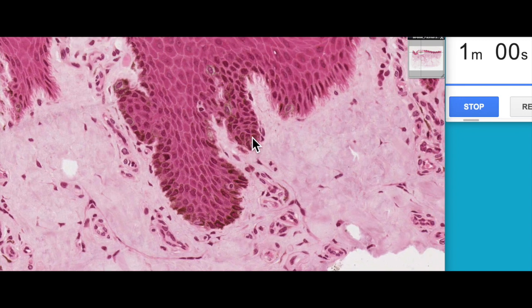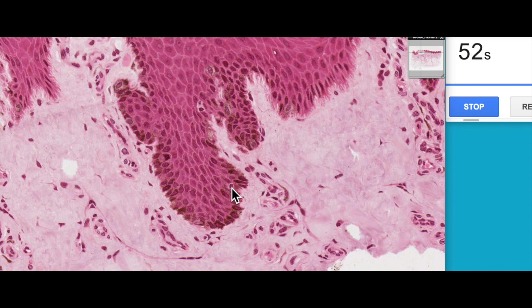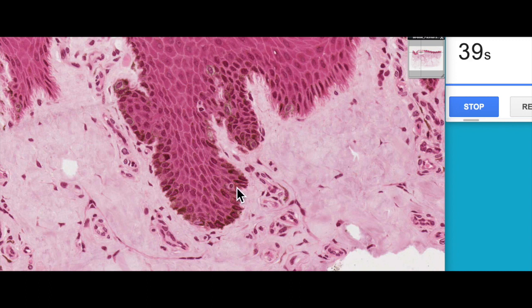So that's the first of the non-keratinocytes. Another type of non-keratinocyte, although very difficult to distinguish histologically through normal H&E staining, are Merkel cells. These are mechanoreceptors that detect light touch. They're often associated with a sensory afferent axon that detects deformation of the epidermis, which it interprets as light touch.